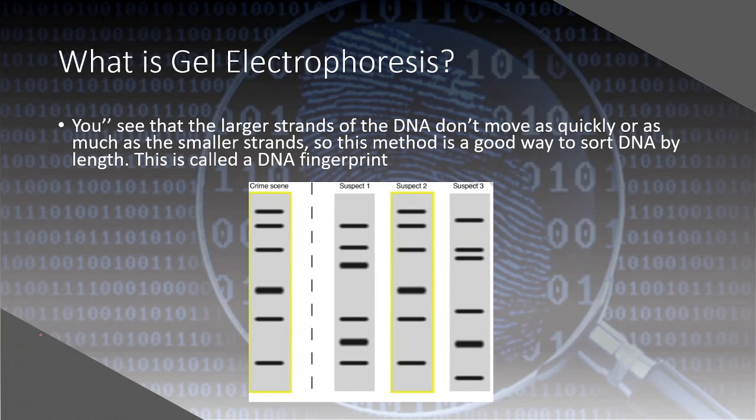Well, that's very easy to figure out. All we can do is try and match up the DNA fingerprint with the suspect. So, over here we have the crime scene. So, does suspect 1 have a line over here? Nope. So that means suspect 1 cannot be the killer. Can we check suspect 3? Suspect 3 doesn't have a line over here either, but it does have one over here. But you can see that they don't actually match. So we can also rule out suspect 3 too.